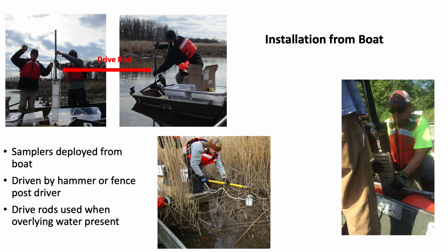Here the sampler is being driven in using a sledgehammer into marsh from the boat. And here we've actually attached 2 boats together to make the platform more stable. So almost any kind of arrangement can be adapted. Larger boats are obviously easier, they're more stable, but usually the sediment is soft enough, even in the case of sand caps, that the samplers can be fairly quickly and easily driven in without much of an issue.